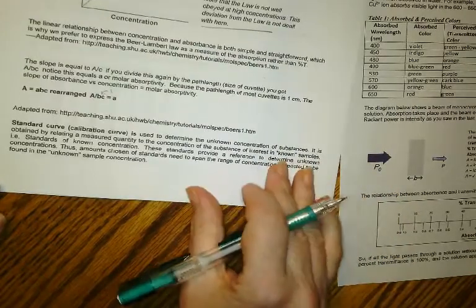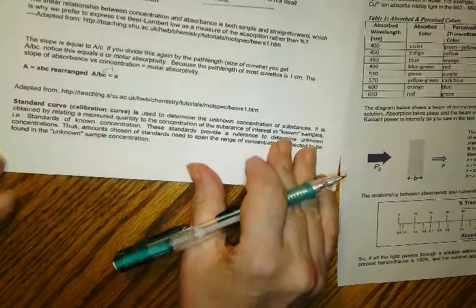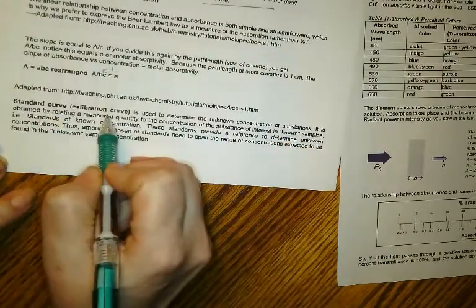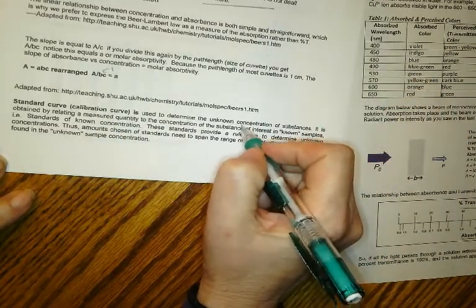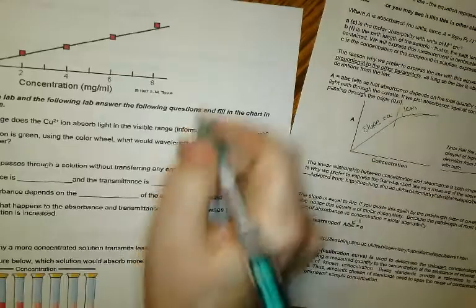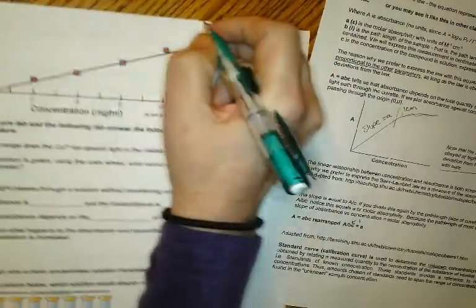And now, what you really need to understand is what a standardization, a standard curve or calibration curve is, okay? We use this a lot, not just in Beer's law, but it lets us determine unknowns. So let me show you how that works. Here, this is any sample.